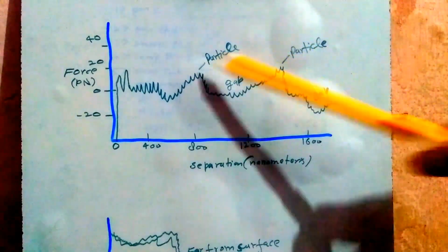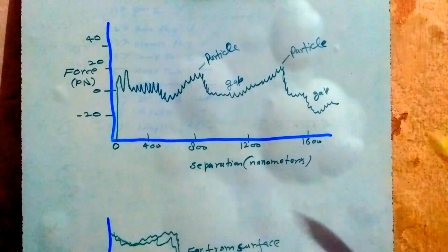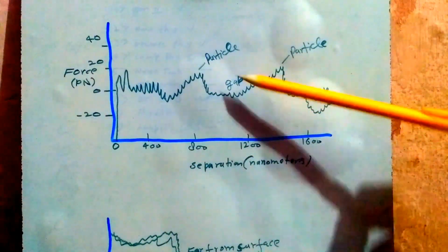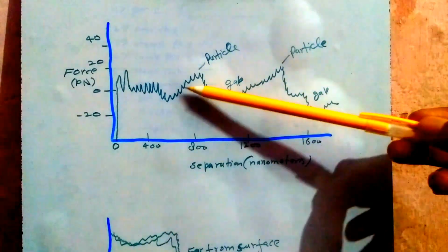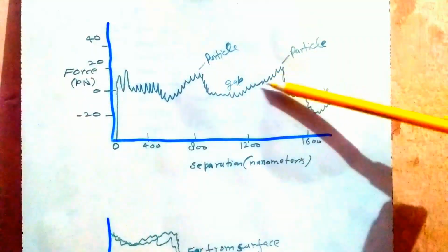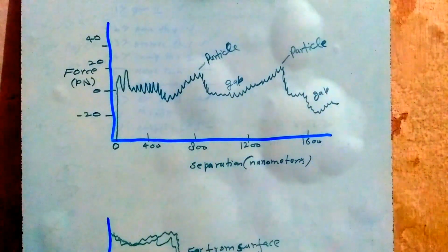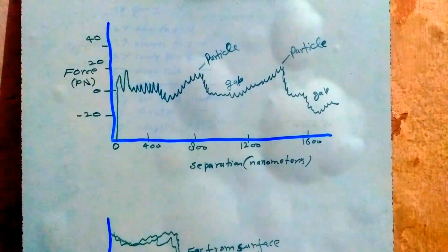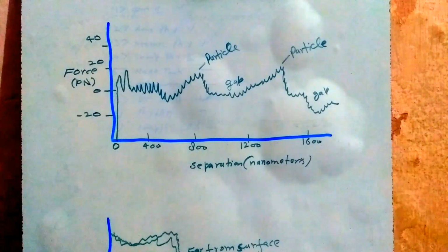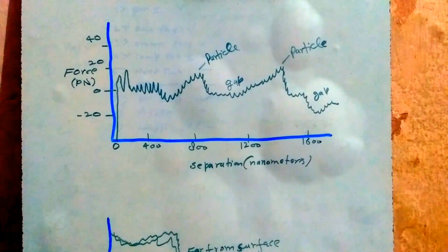There are the particles, and the lower graph tells that there was nothing, no atom, or there was bonding between two atoms. So the atom gapping is given by the graph, the gap and then the particle. So this graph is telling a lot of information about the structure of the surface of the nanomaterial.